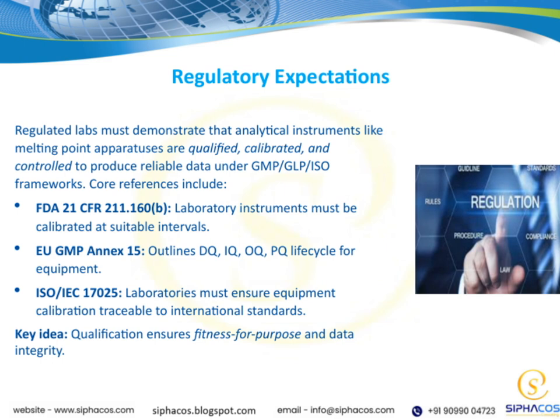Additionally, ISO/IEC 17025 emphasizes that laboratories must ensure their equipment calibration is traceable to international standards, which is vital for maintaining consistency and credibility across different settings. The core idea here is that qualification isn't just a box to check. It's about ensuring that your equipment is fit for purpose and that the data generated is trustworthy. This ties directly into our overall goal of maintaining data integrity and compliance across all our operations.